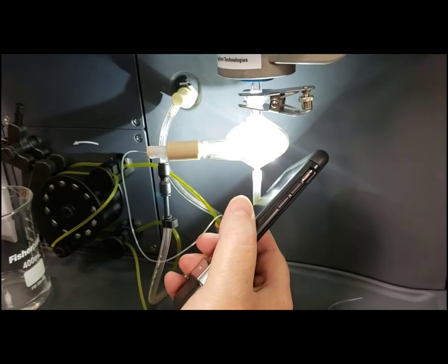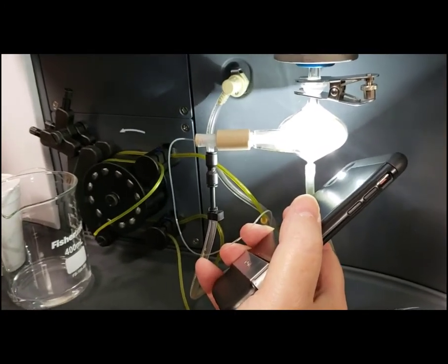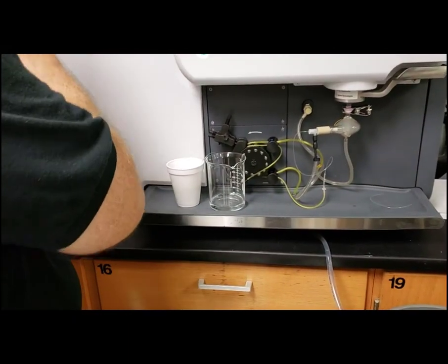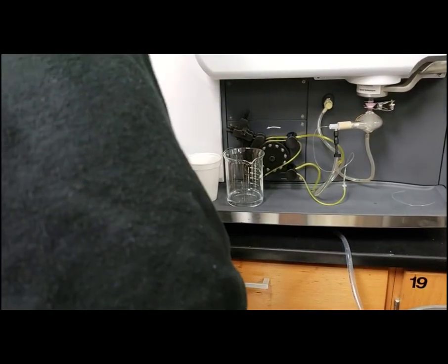So we have to wait 20 minutes. We'll just let that do its thing. By the time 20 minutes is done, that should be pretty much all done. So we have to wait 20 minutes, right? Yes.